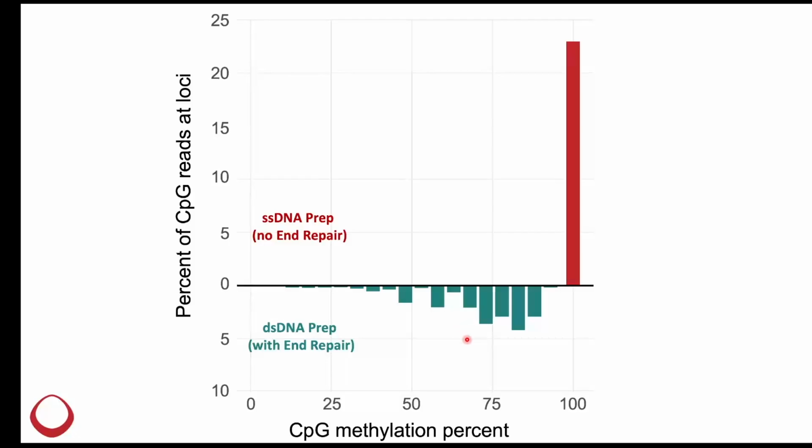And the fact that you have more hemi-methylated or more partial CpG methylation states closer to 100% is just indicative of this end repair process. Overall, this plot supports the initial plots, but it is a nice way to visualize that there are just more end repair based hypomethylation states at the end of molecules, and that's contributing to this.